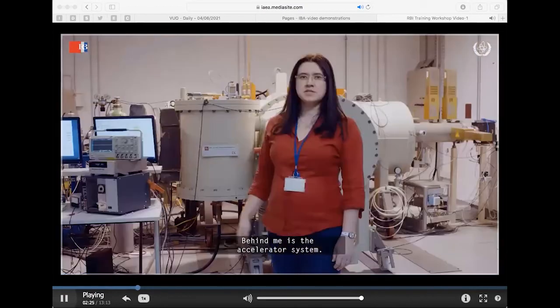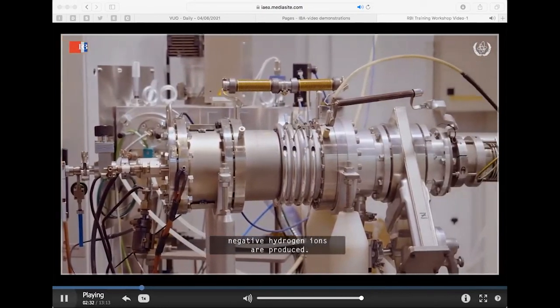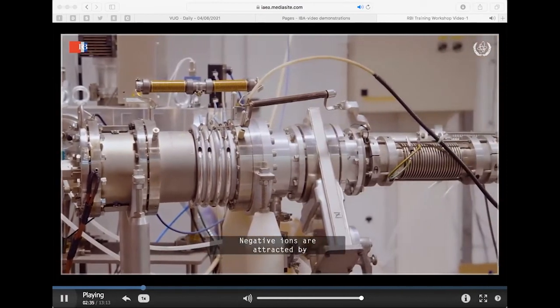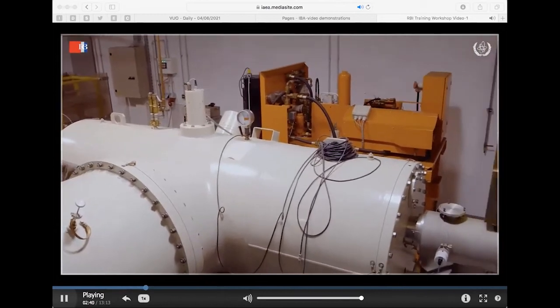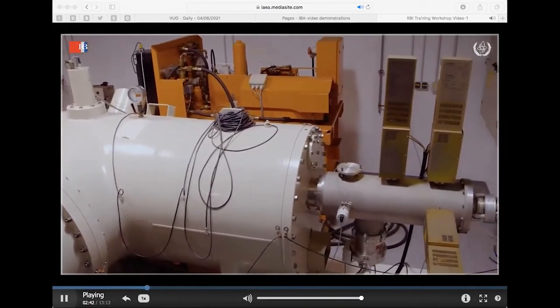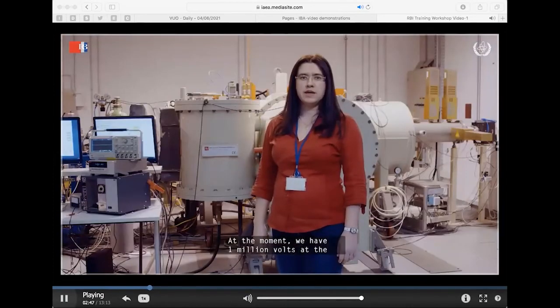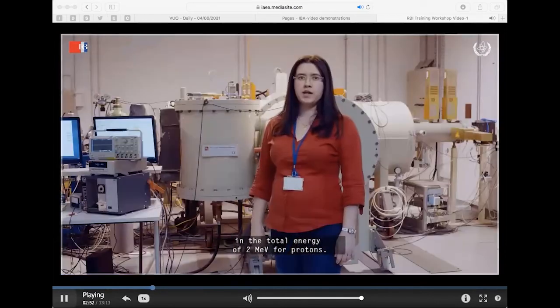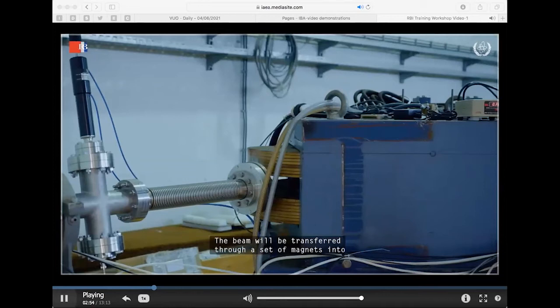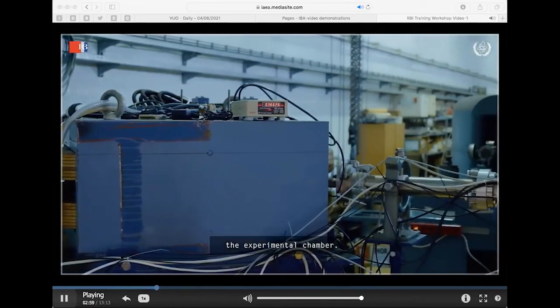So behind me is the accelerator system. Everything starts with the ion source, where negative hydrogen ions are produced. Negative ions are attracted by the positive potential of the accelerator. At the moment, we have 1 million volts at the terminal of the accelerator, which will result in a total energy of 2 mega-electron volts for protons. The beam will be transferred through sets of magnets into the experimental chamber.